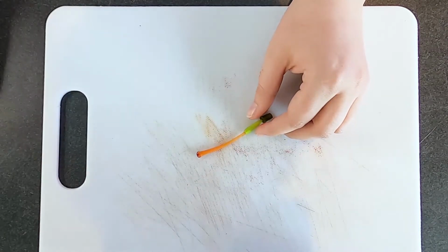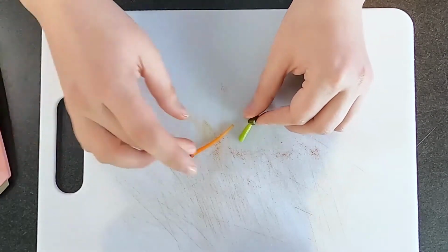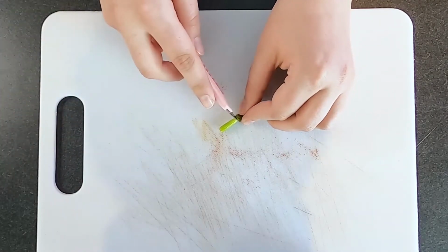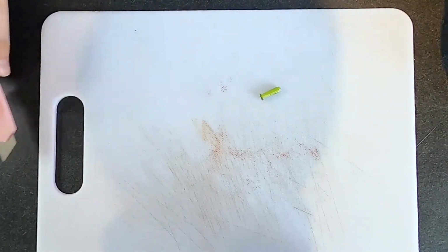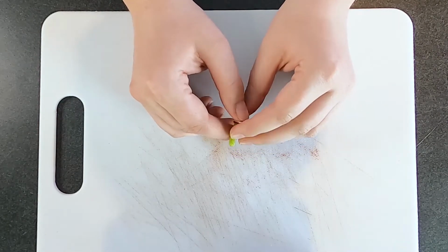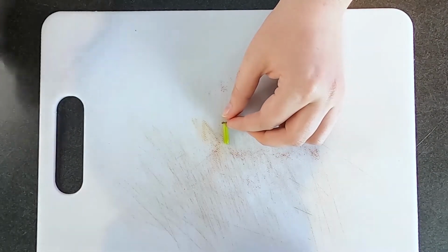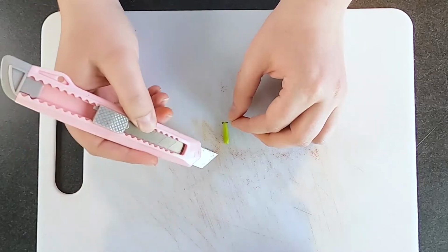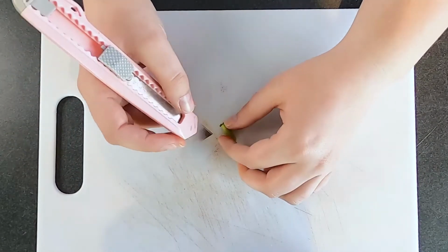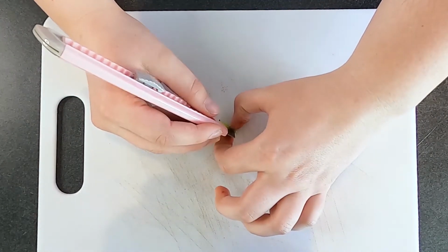So what I'm just going to do here really quick, I'm just going to cut off the stigma and the style here. And what we're left with is the ovary. So I'm also just going to cut off the bottom here. We have now just the ovary. The ovary is a very important part. This is the female part. So this is where the eggs are held and are produced. So once they are fertilized by the pollen, once they travel all the way down, they will create seeds. So we're going to try and cut this open, and we're going to see if there's actually any unfertilized eggs in here.